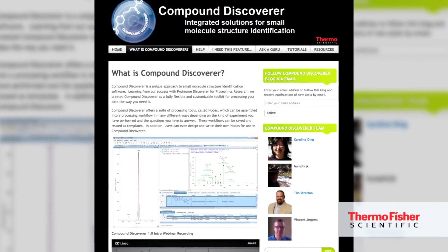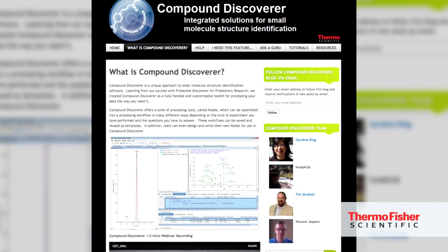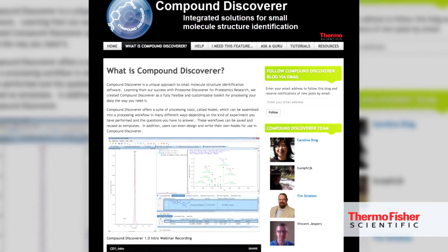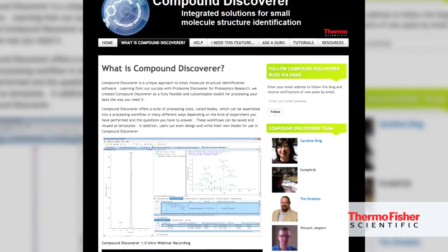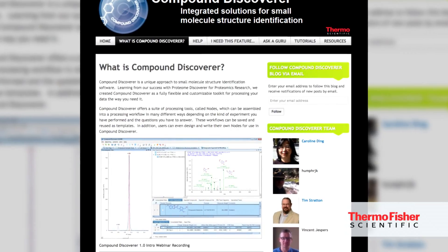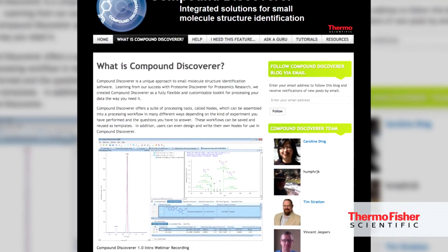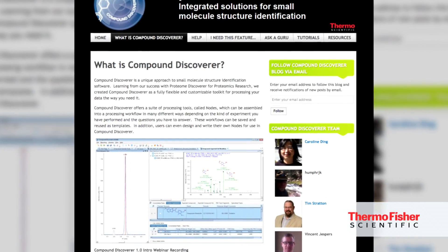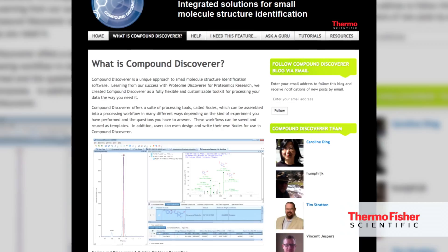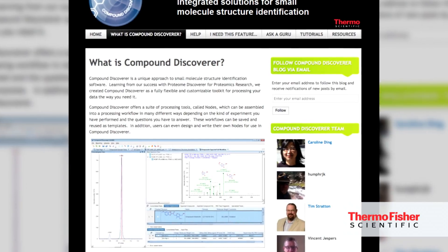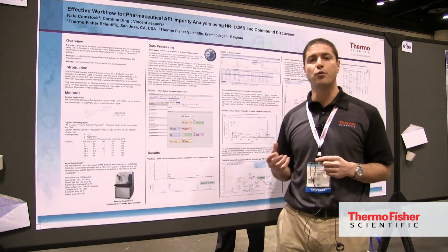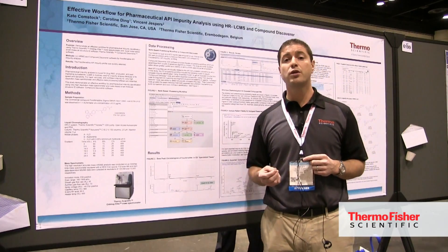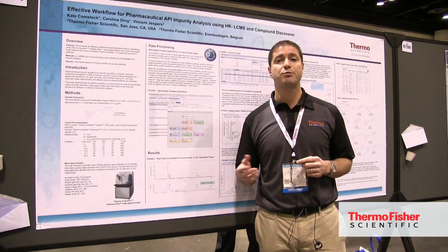Result displays for tables, spectra, and traces are highly customizable and can be rearranged on the screen to provide the best visualization for a specific workflow or simply based on user preference.